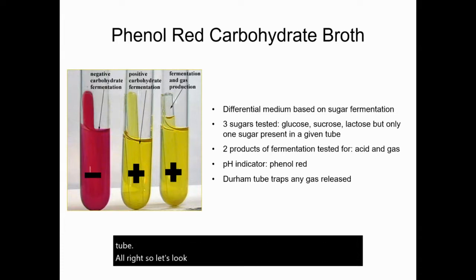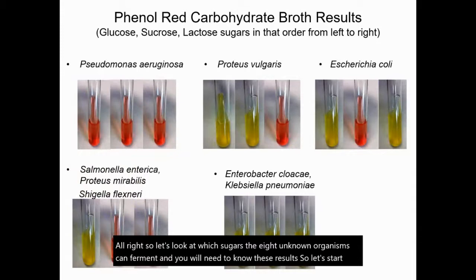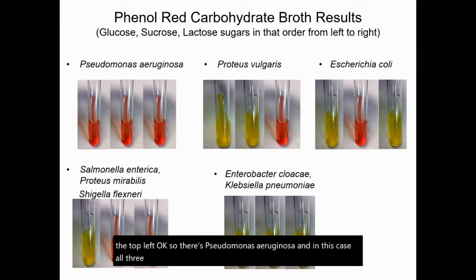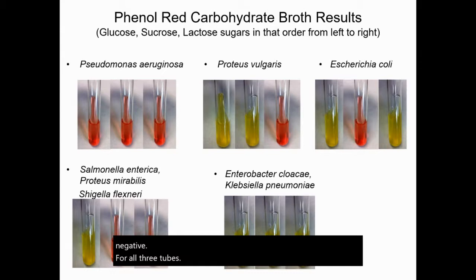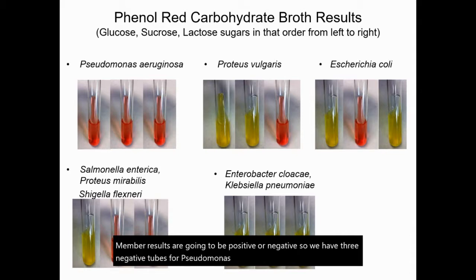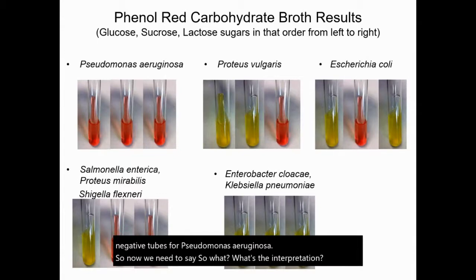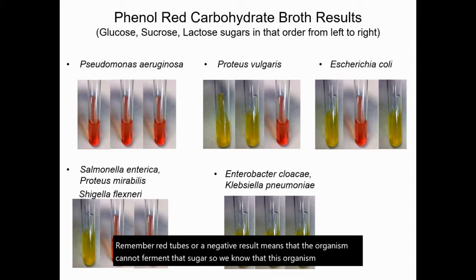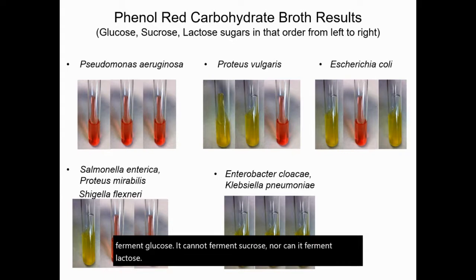Let's look at which sugars the eight unknown organisms can ferment — you will need to know these results. Starting with Pseudomonas aeruginosa: all three tubes are red. That means Pseudomonas aeruginosa is negative for all three tubes. Remember, results are going to be positive or negative. Red tubes or a negative result means that the organism cannot ferment that sugar. So we know that this organism cannot ferment glucose, it cannot ferment sucrose, nor can it ferment lactose. No fermentation for this organism.